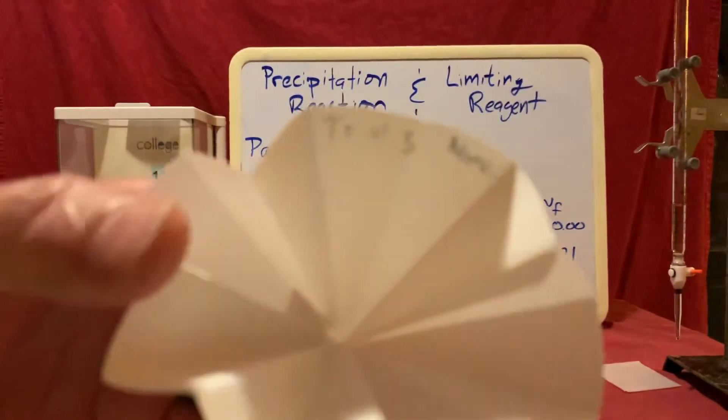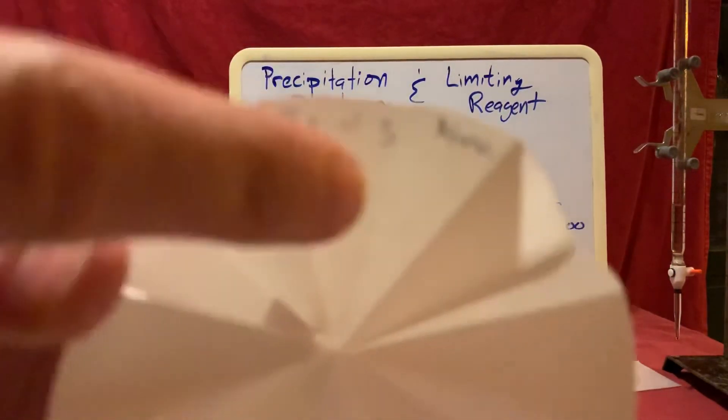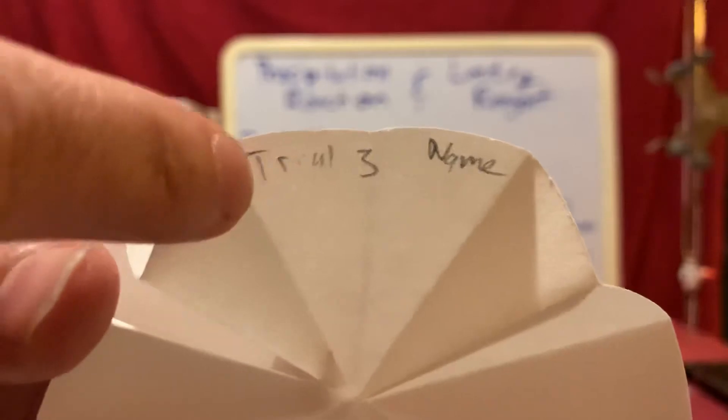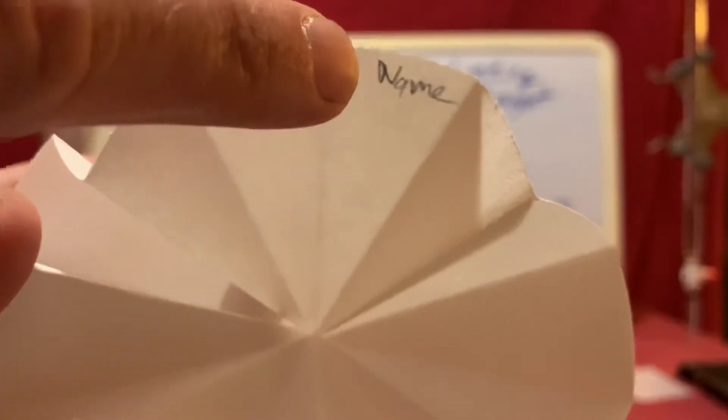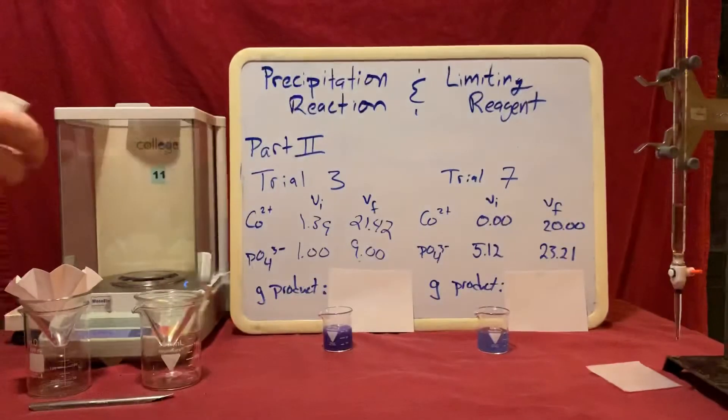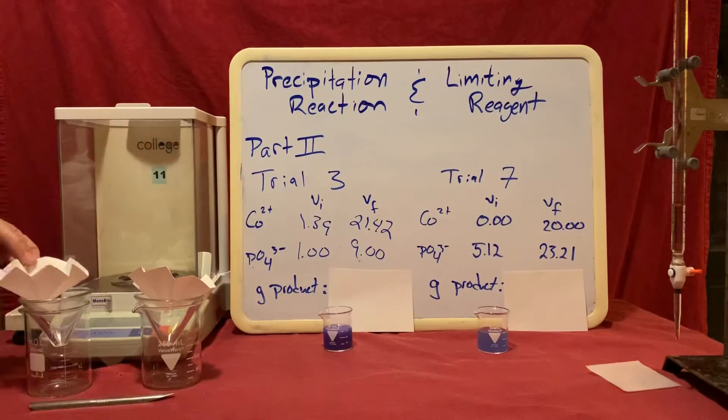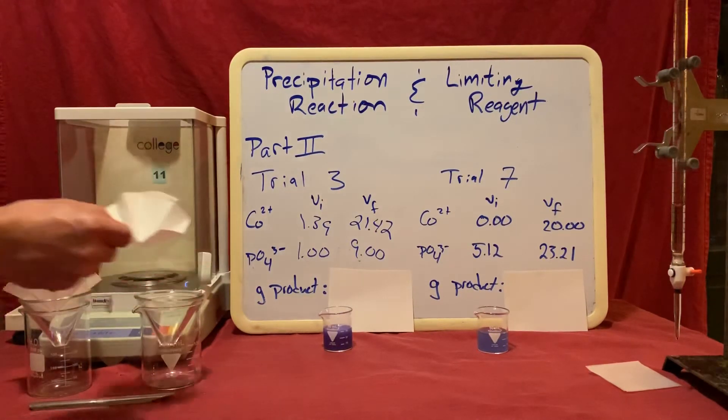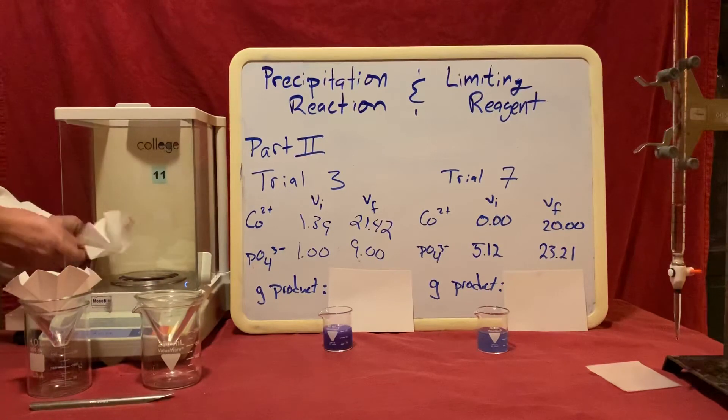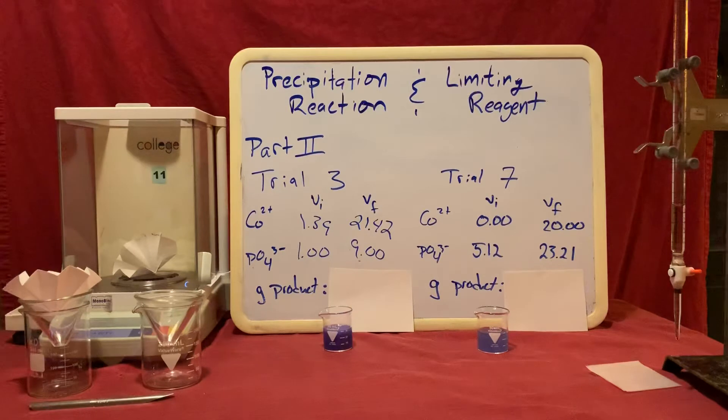I've also placed the trial number here, trial 3, along with my name or your name. I've done the same with a piece of filter paper for trial 7. Prior to pouring anything in, I will get the mass of each one of these filter papers and record that in my notebook.